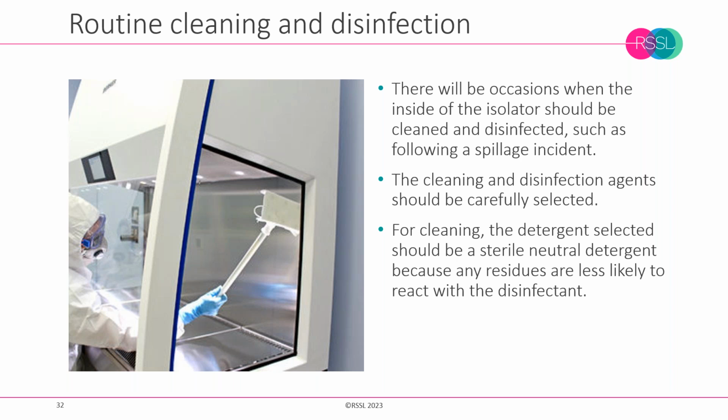It's also important if we're using hydrogen peroxide not to use a chlorine-based disinfectant, or if we do use a chlorine-based disinfectant, then we're really making sure that all the residues have been removed, because you can get quite horrendous reactions between chlorine residues and hydrogen peroxide residues. And the result of that will be that particularly stainless steel will start to get brown pitting on it.